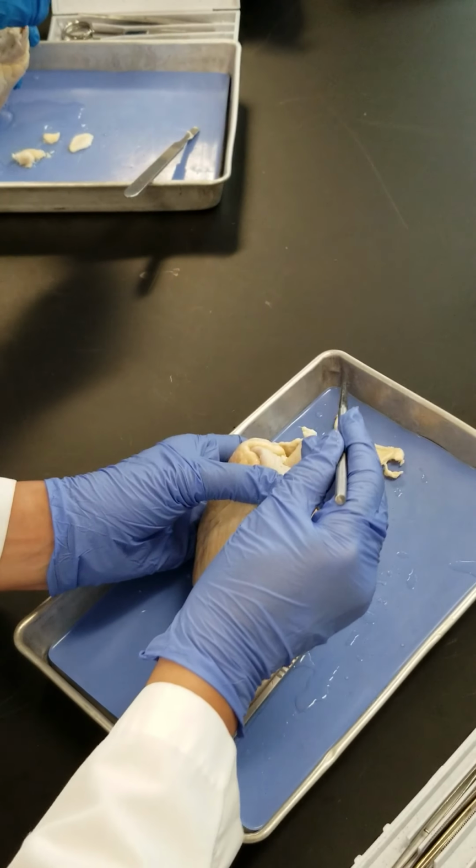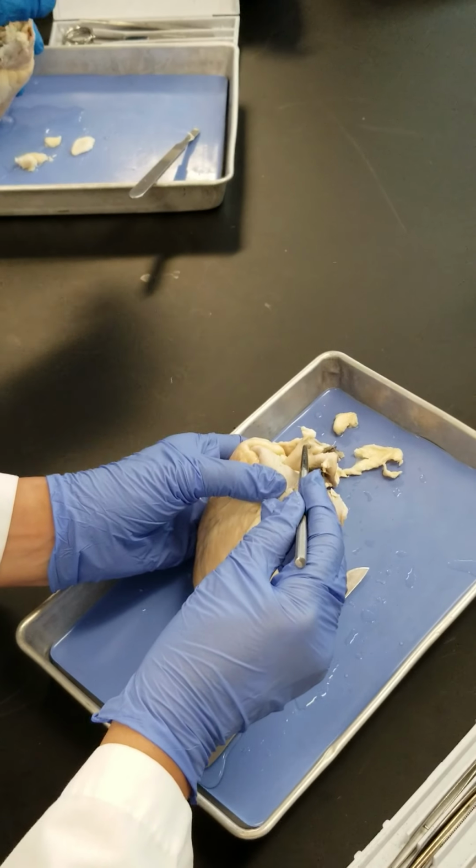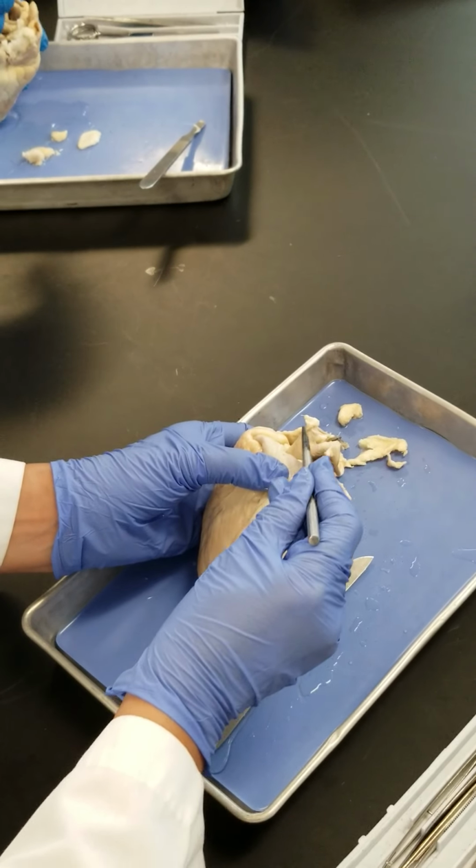What is the first branch on the arch of the aorta? Brachiocephalic trunk. Brachiocephalic trunk, this one, right?